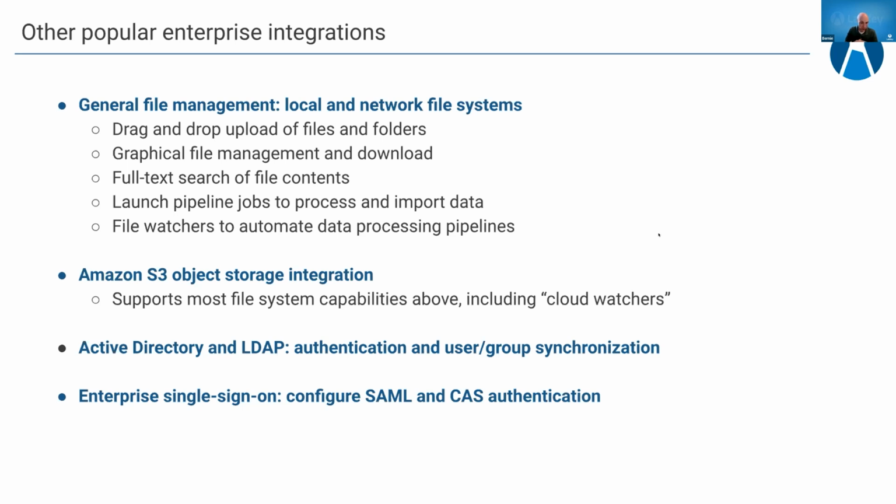There's also one here about how you associate automatically imported data with existing records in the database. Adam, I can let you take this one, but at a high level, when you have sample information registered in the system, we join everything based on that sample identifier, the sample identifiers in the system. So when you automatically bring in new information, if it has that sample ID or an existing alias, we will automatically connect it. Adam, I don't know if you wanted to say a little bit more technically about how that works, but you're certainly welcome to.